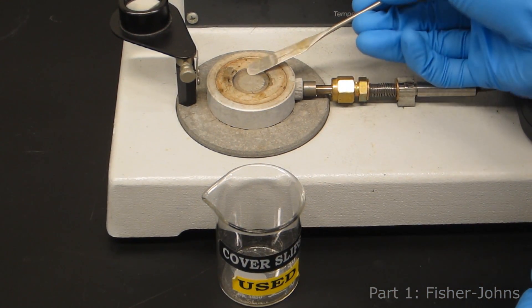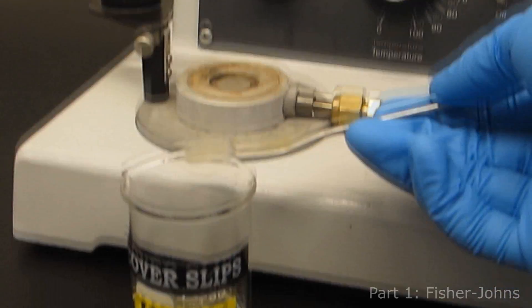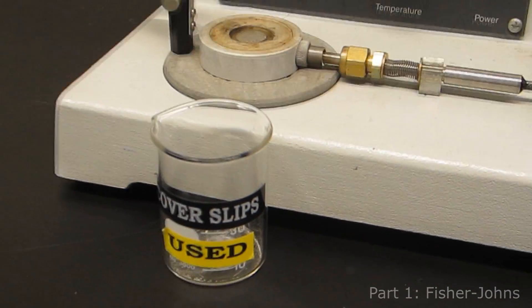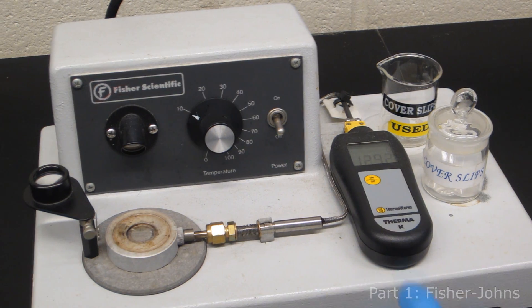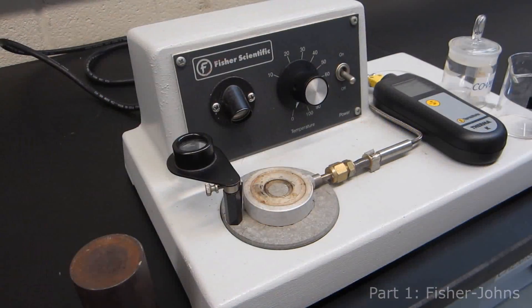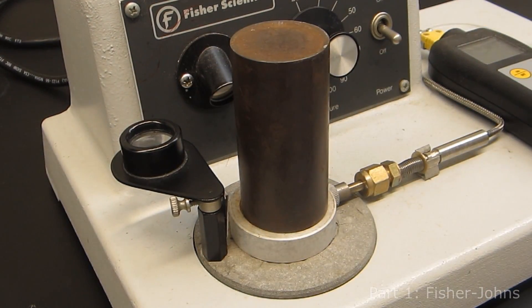Once you have noted the melting range, carefully remove the slides from the hot stage with a spatula and dispose of the plates in the used plates container. Don't forget to turn the instrument and the thermometer off. Be courteous and place the metal cooling rod on the hot stage to cool it down for the next person.